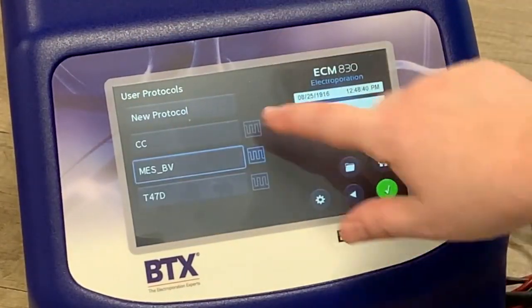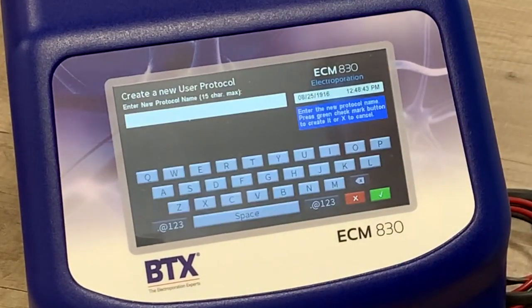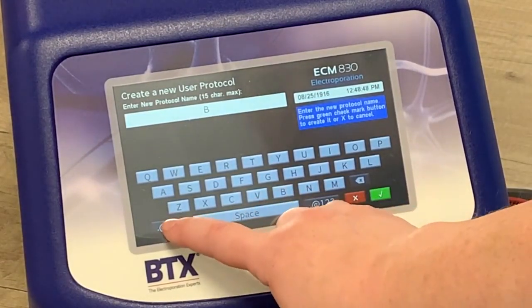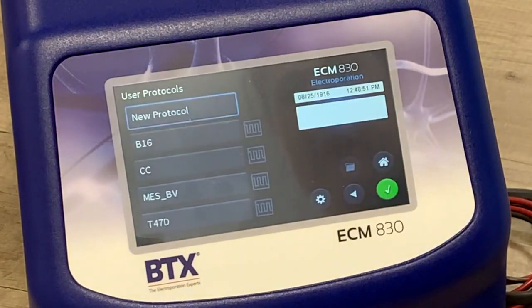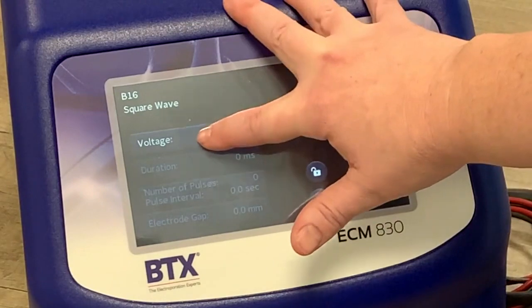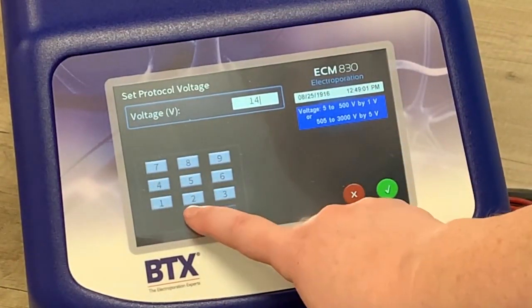All modern BTX instruments come with a list of common preset protocols, but if you are programming your own, then going into the user protocol and typing in a name using the QWERTY keyboard will allow you to set up the new program. From there it's a matter of entering the parameters taken from the application note at the prompts of the instrument.